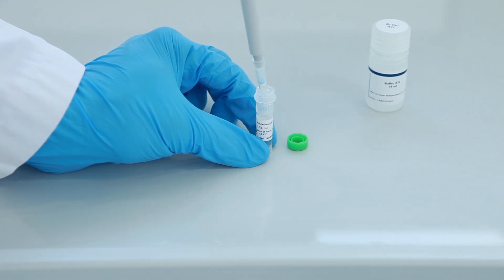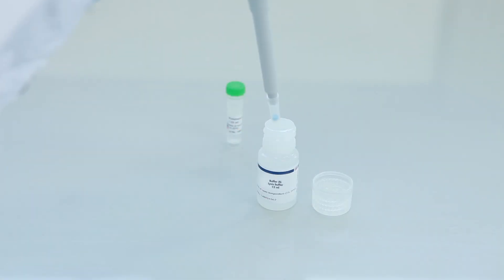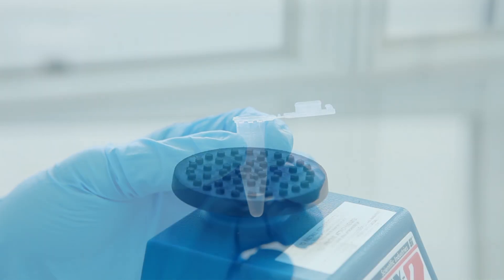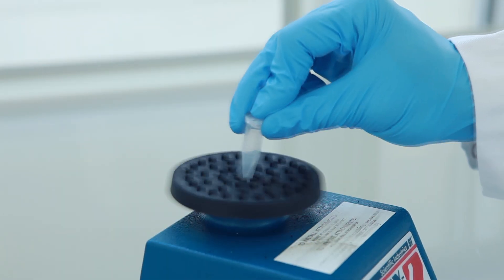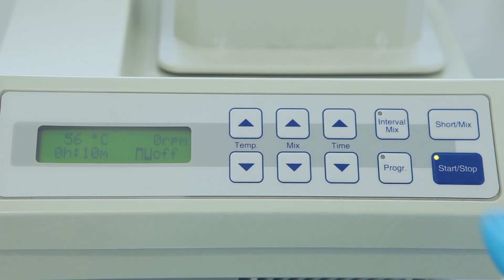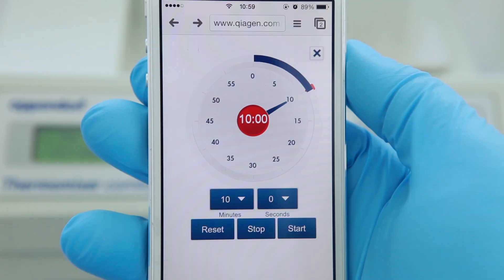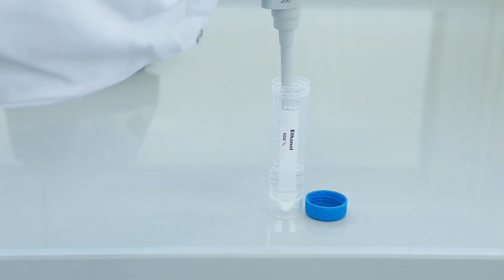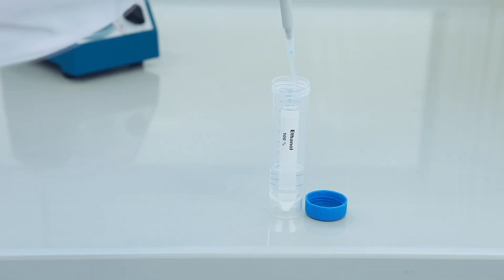The lysis begins by adding the proteinase K to the sample. Then add buffer AL for blood samples or buffer ATL for tissue samples, and vortex thoroughly. If you are working with blood, incubate the sample for 10 minutes at 56 degrees Celsius. Add 200 microliters of ethanol and vortex thoroughly.